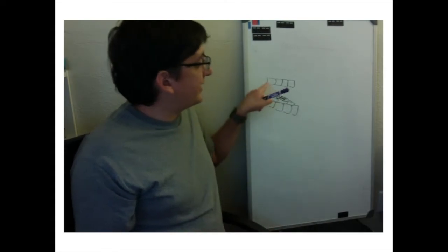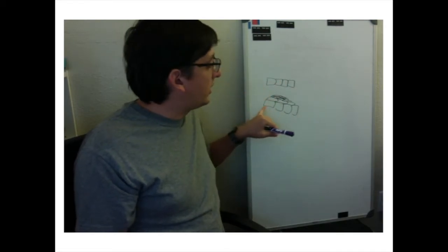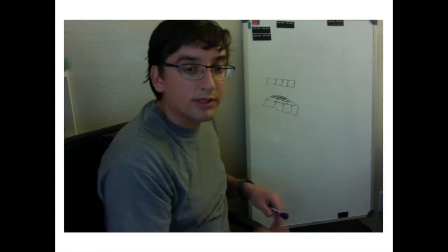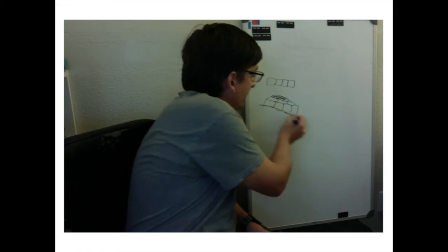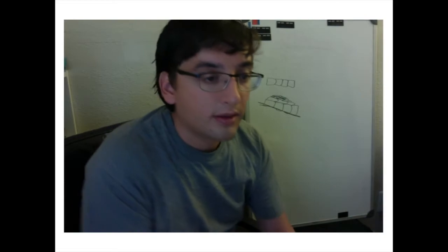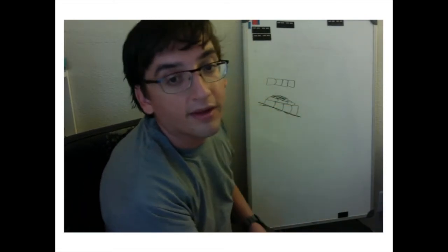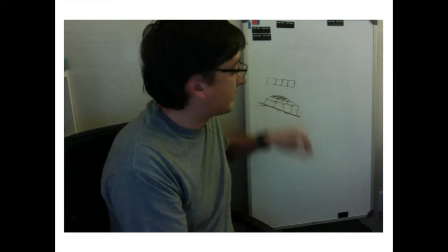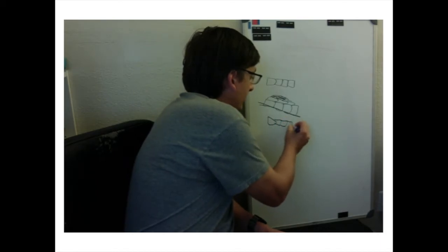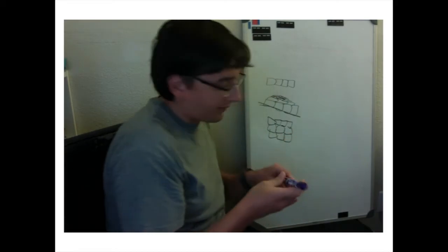In this case we would call this cuboidal, this would be simple cuboidal. You might think, well, this might be stratified cuboidal, but it's actually stratified squamous because, if this is the basal layer, then we don't go by the cells on the bottom, we go by the cells at the top, the apical layer. So that's why this would actually be stratified squamous. If I had stratified cuboidal, even the top cells would be square or cube shaped. Or this might be stratified cuboidal here.